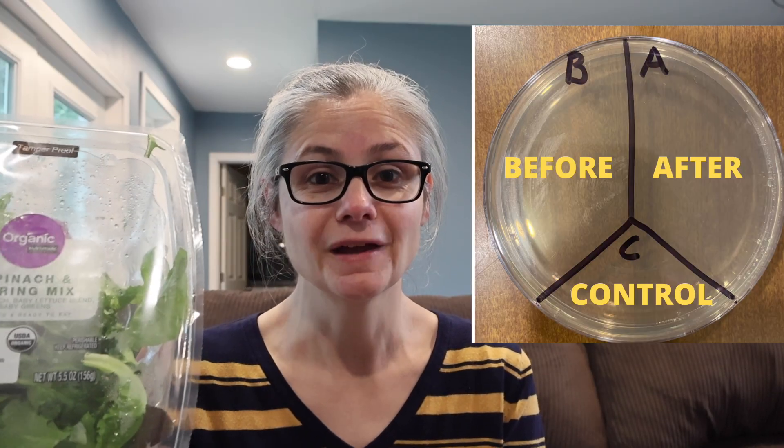In order to test how much bacteria is on the vegetables before and after cleaning, I'm going to take a petri dish and label it A, B, and C. I'll take some sterile swabs and swab the lettuce, placing that sample in the section labeled B for before. Then I'll wash the lettuce according to a couple of different methods, swab the lettuce again, and place that sample in the section labeled A for after. C is my control — nothing goes there.